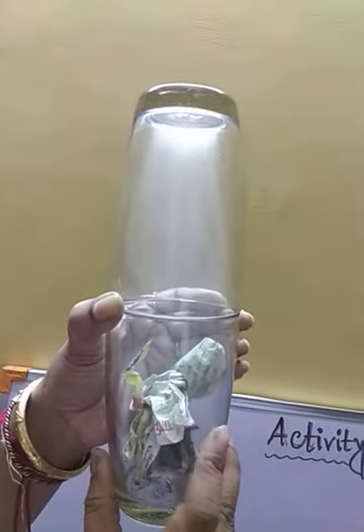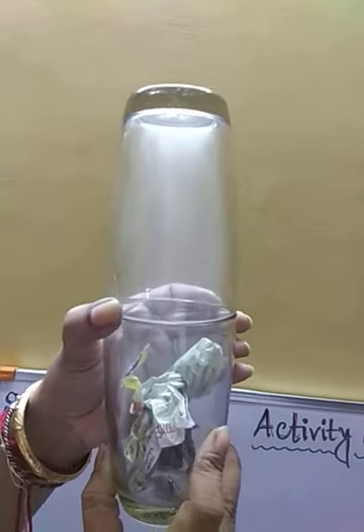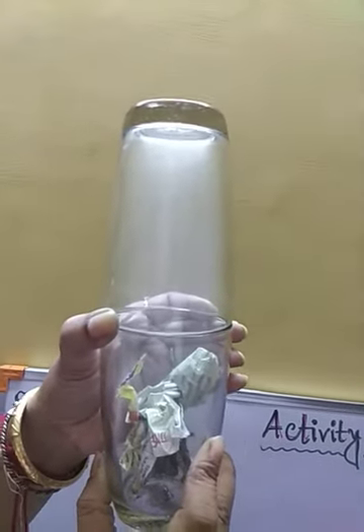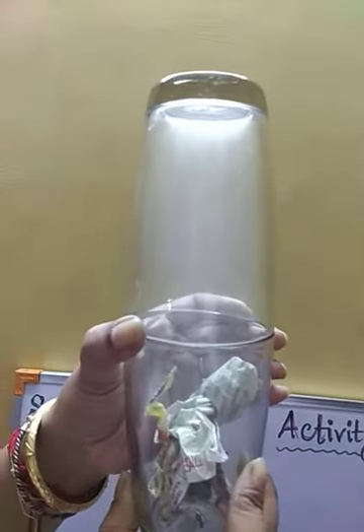You have to be a bit careful because you are using glasses, and as you are using fire, for that also be very careful when you are doing this at your home.